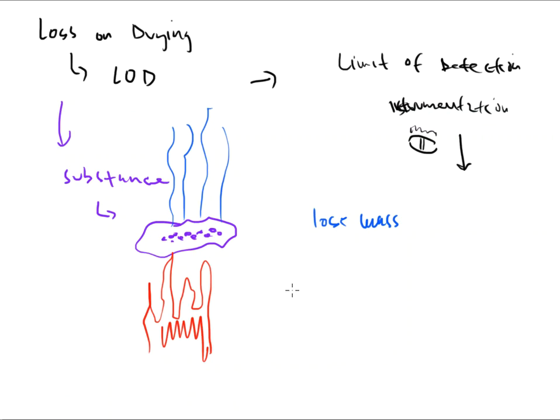What I'll do is that I'll get the grams of the substance before I do anything to it. This is with the moisture involved. And then if I take the grams of the substance after heating, this is going to weigh less, right?